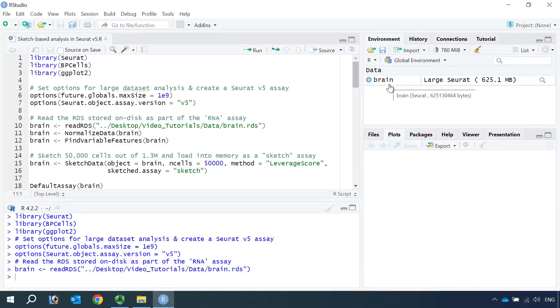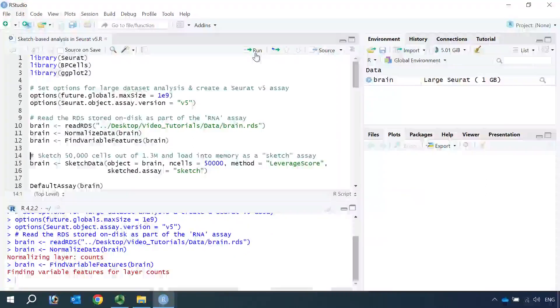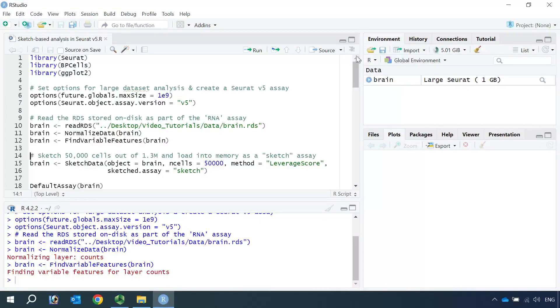Now we can normalize the dataset. After data normalization, we can find the variable features for this dataset. My laptop only has 32 GB RAM, so I will not be able to analyze the full dataset on my laptop using the standard Seurat workflow analysis. So Seurat v5 developed a sketch-based workflow analysis, which makes it possible to analyze this dataset on my laptop.